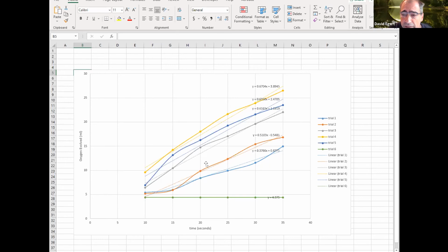It could be that the flask wasn't properly cleaned, or there was some residual stuff in the flask, for instance. That could cause problems, contamination of the flask that you're mixing things up in. So there are so many things that can go wrong. If I got this data and I really cared and I had more time and this was more my actual research, I would say, okay, this is interesting, but I need to do this again before I really trust what's going on here.